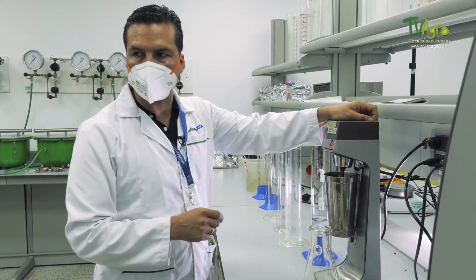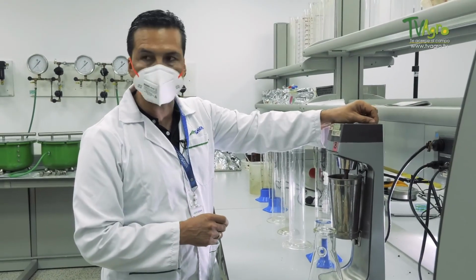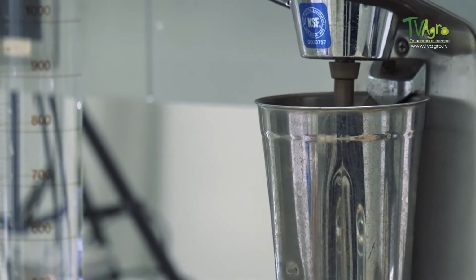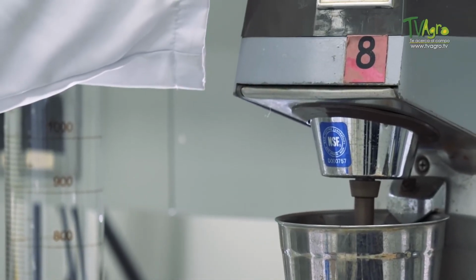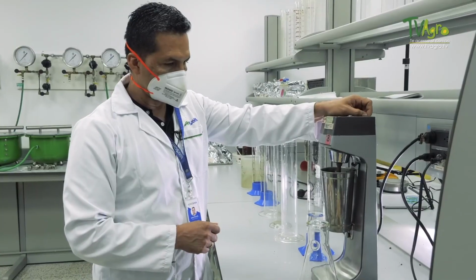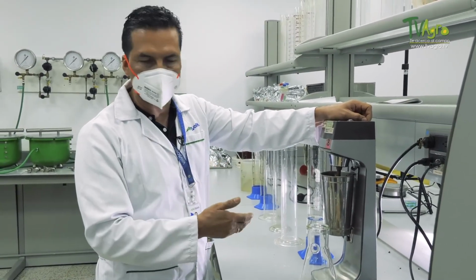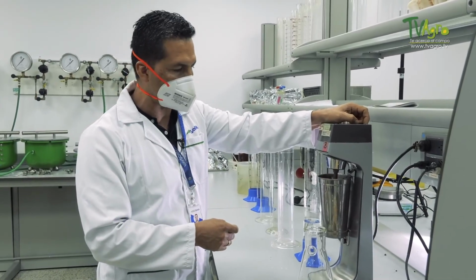Here we do the process that we have done with the sample and the dispersion as such with the dispersing solution. Usually it can be the time indicated in the protocol that we have already established to do it.